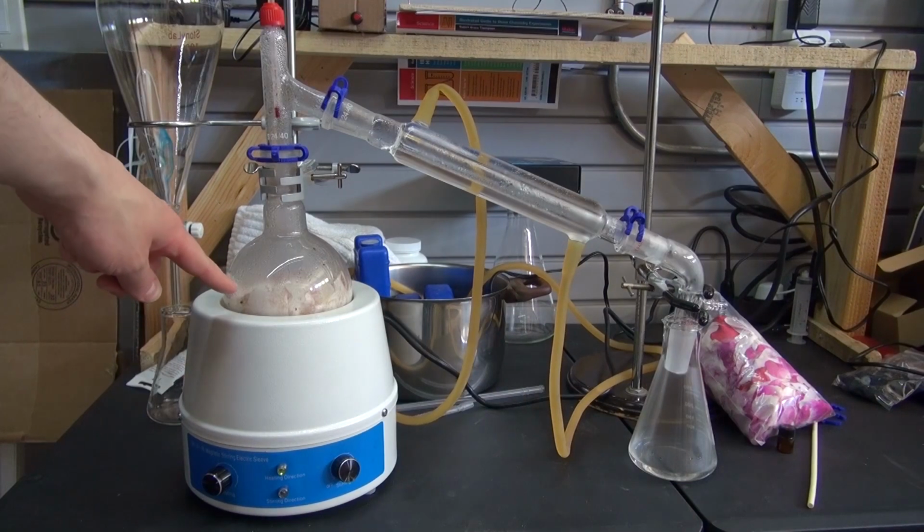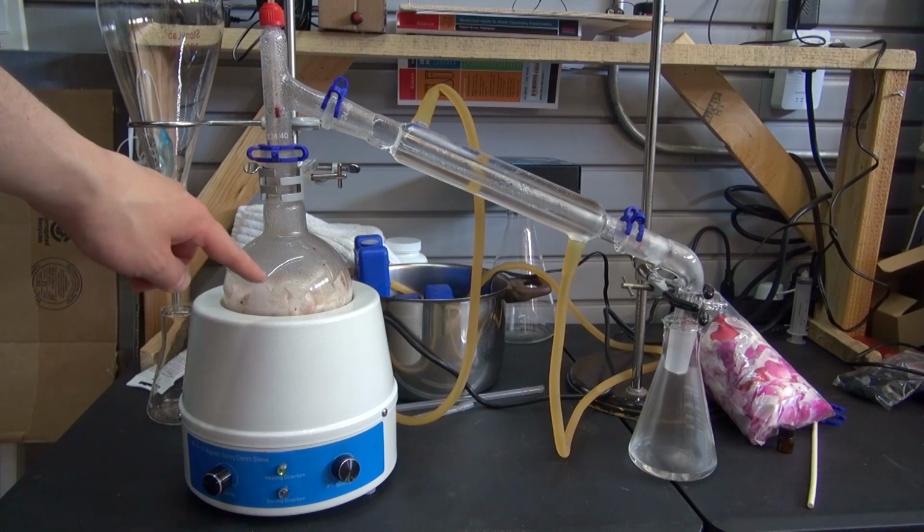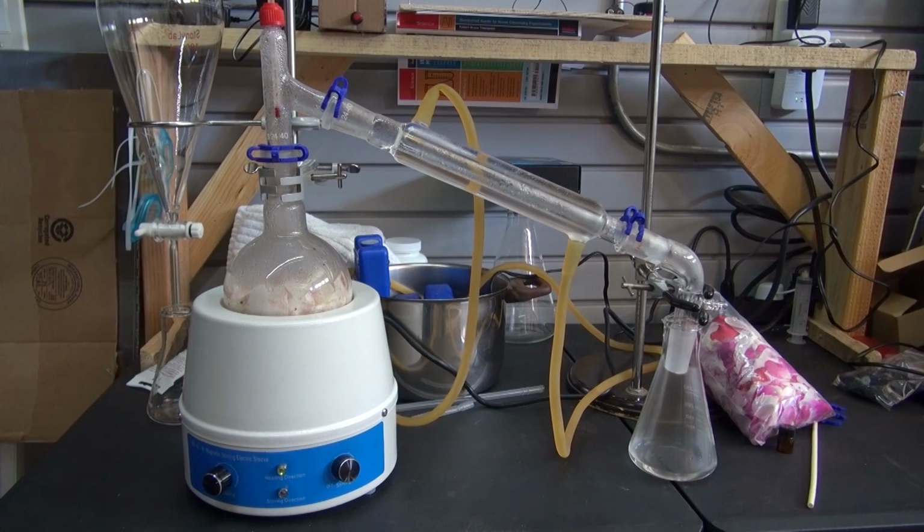30 minutes later, and as you can see, the rose petals have lost their color, and that means I've collected in my Erlenmeyer flask a little bit of rose hydrosol.